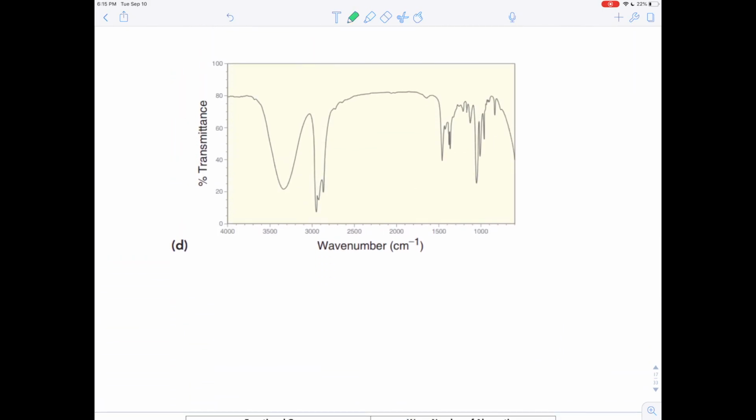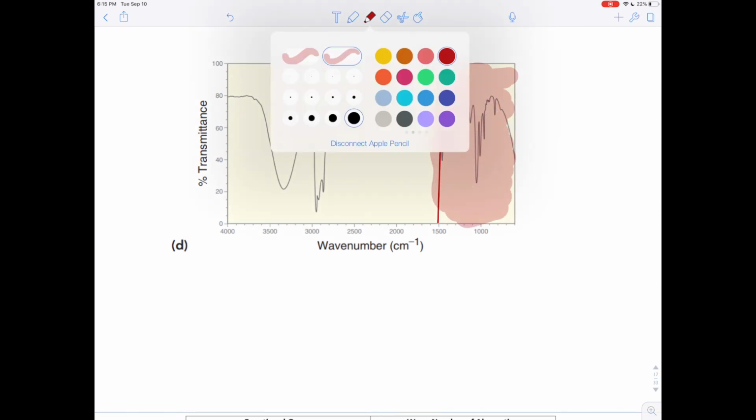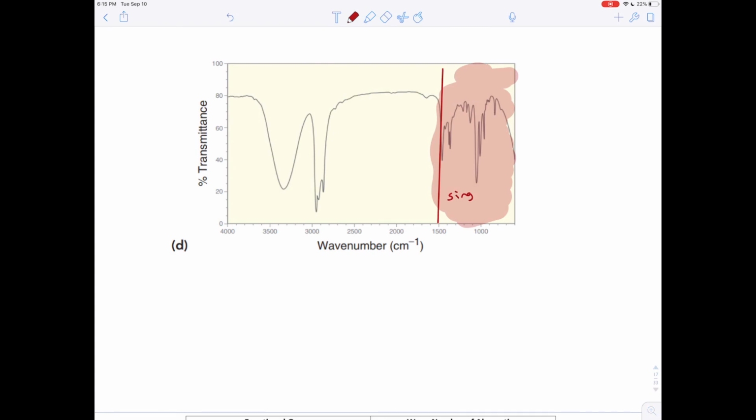So we've got this spectrum here. Let's just analyze it, identify all the peaks, and then we'll compare it to the molecules they have. First, draw that line at 1500. Everything to the right of that line is going to represent the shadows cast by single bonds in that unique fingerprint region. Another useful place to draw lines is at around 3000. Just to the right of 3000, you'll have this shadow right there. That's a shadow being cast by an sp3 carbon with all single bonds, to a hydrogen. It's this bond right there that casts that shadow.